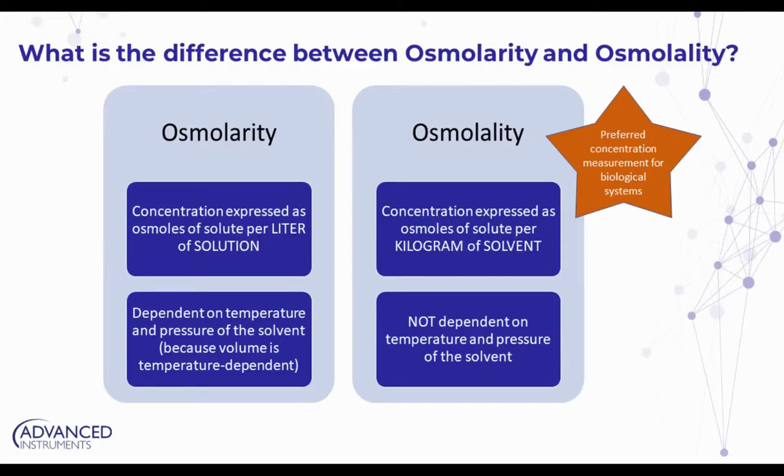So the retention time or the yield would highly depend on the temperature. So when you actually, for instance, prepare a buffer at 4 degrees and then use the buffer at room temperature, pH and conductivity would change. Osmolality does not. I think this is one of the prime examples.